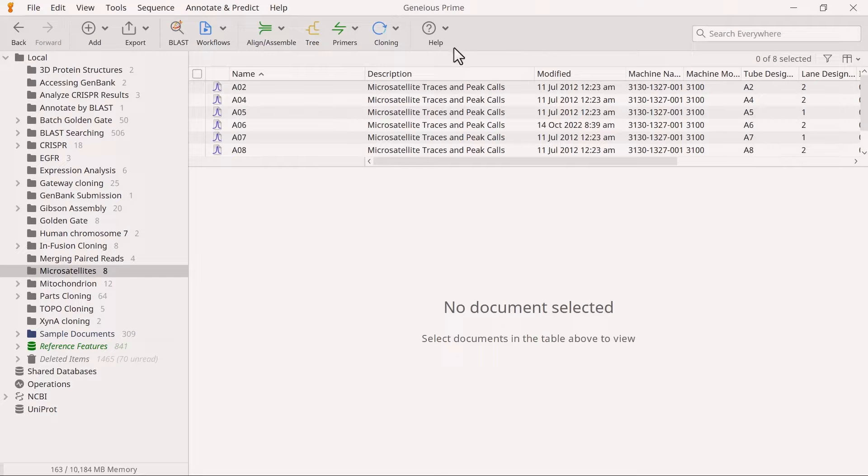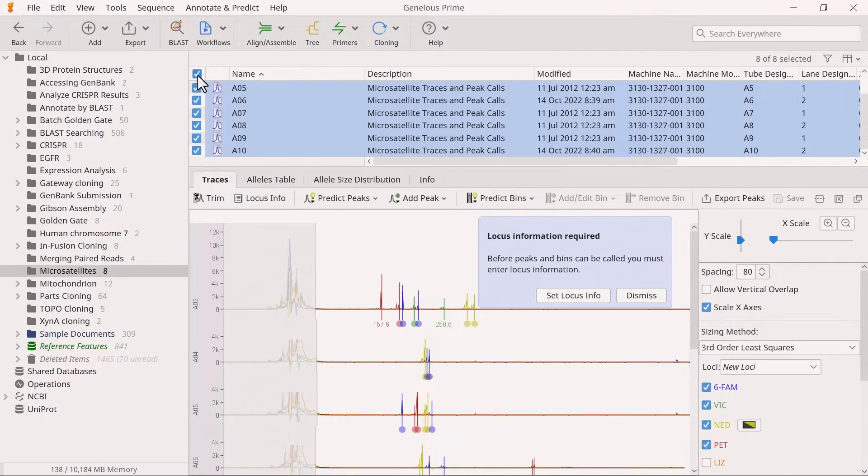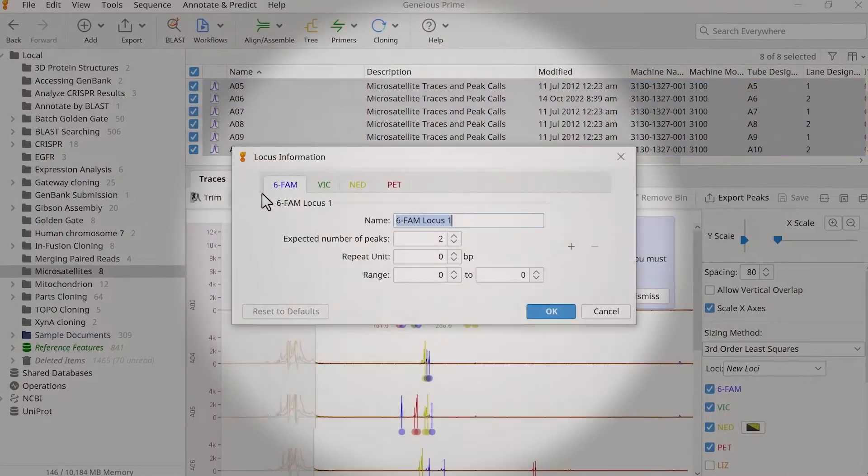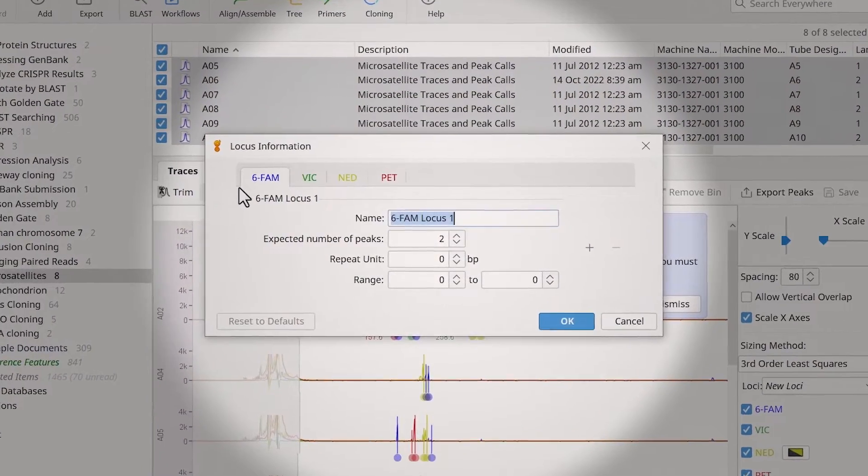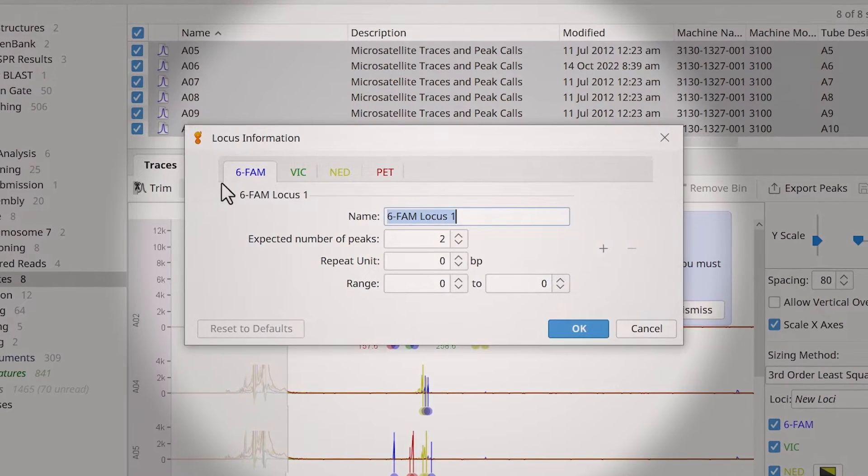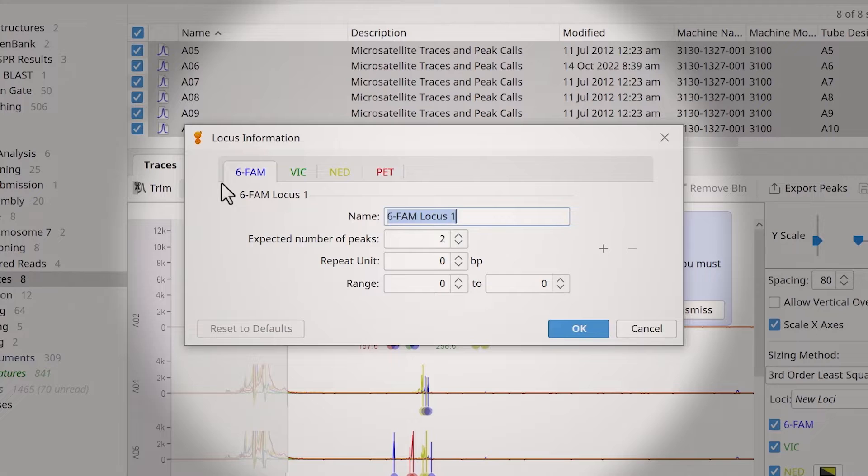To do this, select all the sequence traces and choose the locus info button. In the locus information window, you can adjust the dye settings individually. These include defining the number of peaks, repeat units, and range for each loci.